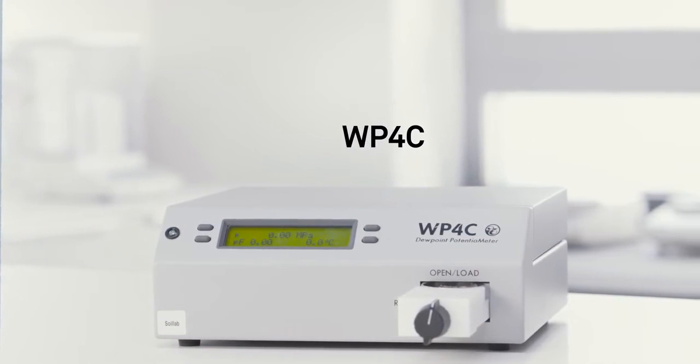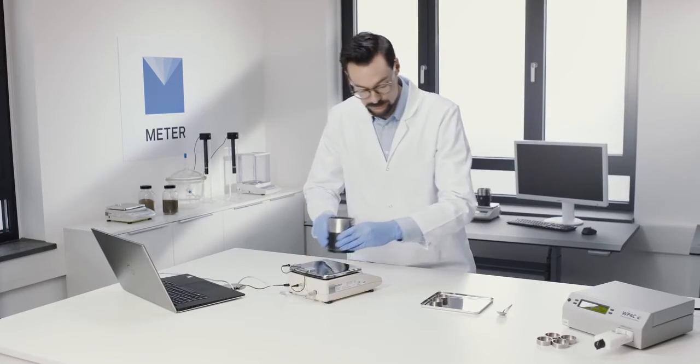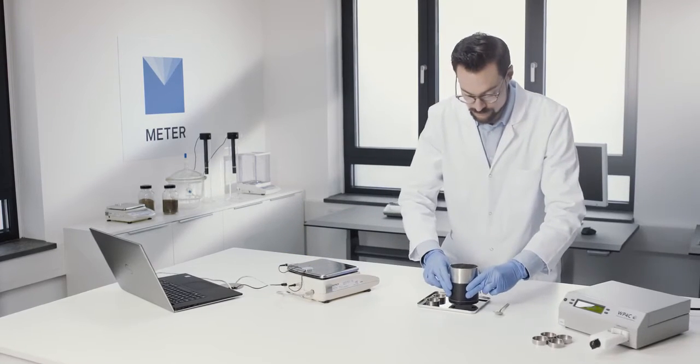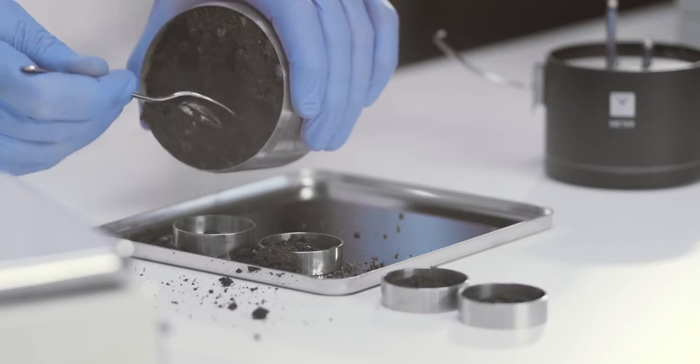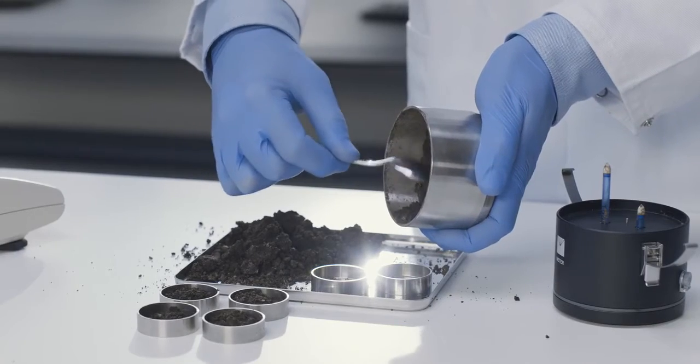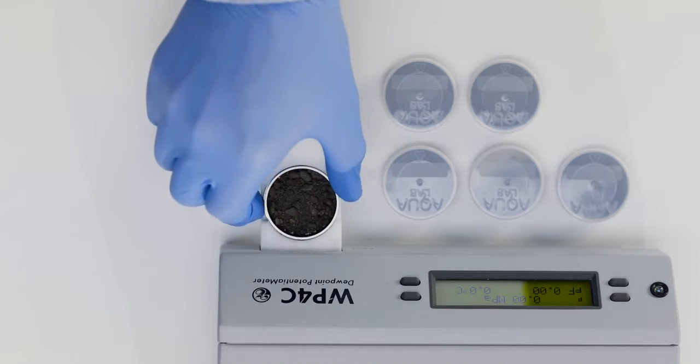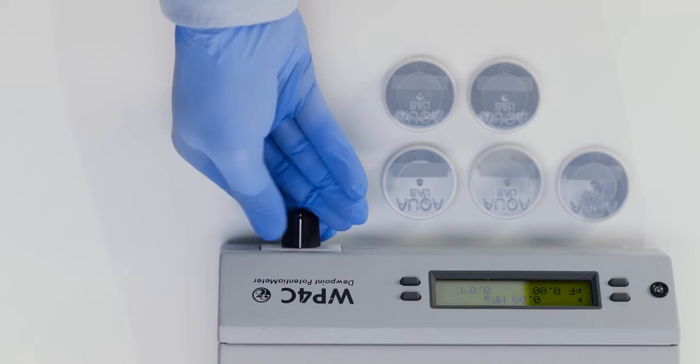Set up the WP4C. Remove the sample from the HyProp and take two samples each from the top, middle, and bottom of the soil core. Finally, measure all six samples with the WP4C to complete the dry end of the moisture release curve.